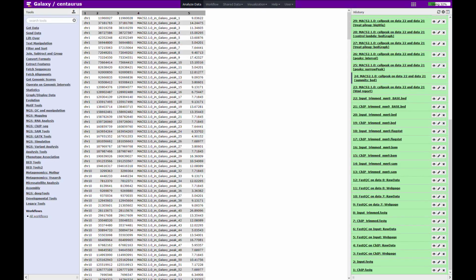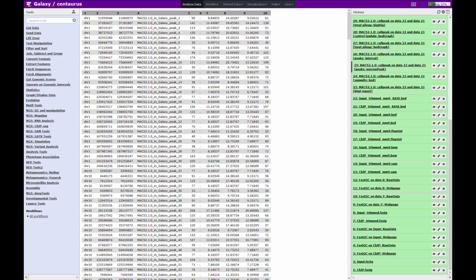So moving on, the next file is in this case the narrow peak file, but if you're running the broad version of the analysis, this would be a broad peak. And if we look at this, this is an ENCODE format, and it's particularly useful in that it will display both the start and end of the entire candidate region plus the summit in one track.